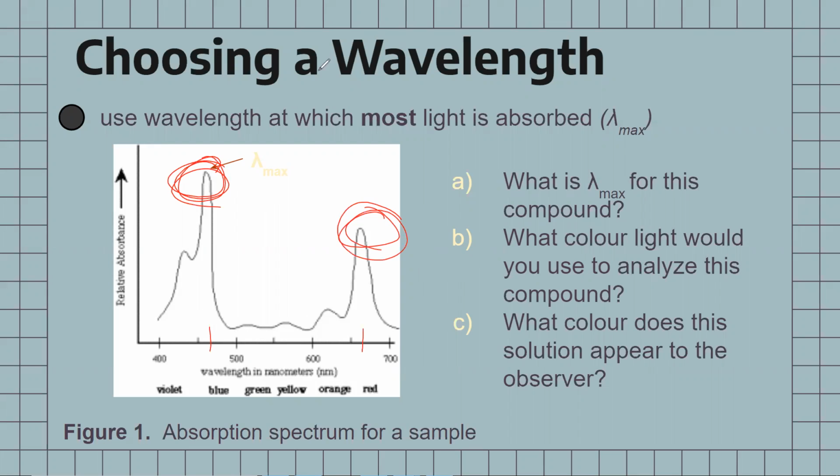But if you don't have an absorbance curve, it is easy to look up the proper wavelength to analyze a sample at for any particular chemical. So either you're reading one of these graphs or you are looking up that information. For our copper sulfate, a wavelength of 635 nanometers is going to be our lambda max, or our max absorbance wavelength.